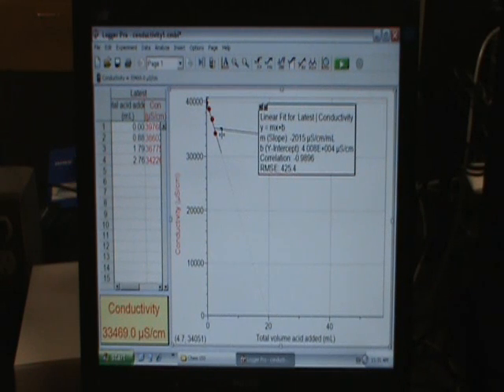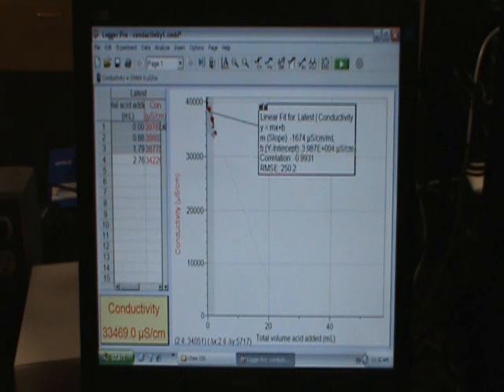And the nice thing about this is, if you point to it, you can actually adjust that linear fit after it's on the screen. So, if you made it a little too big, you can knock a point off. If you made it a little bit too small, you can drag to add an extra point. So, if you need a linear fit for anything, this might be a useful tool for you to use.